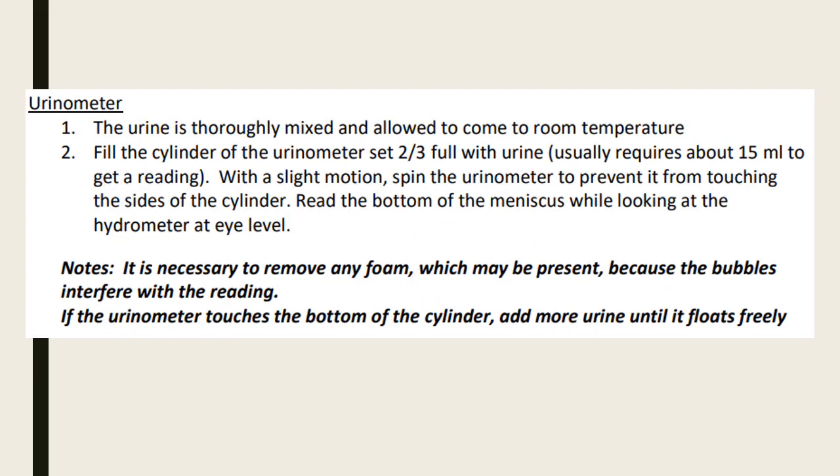Moving on, let's take a look at your urinometer, which is otherwise known as a hydrometer. Accordingly, this one is not recommended by the Clinical and Laboratory Standards Institute. The major disadvantage of the urinometer is that it requires a large volume.